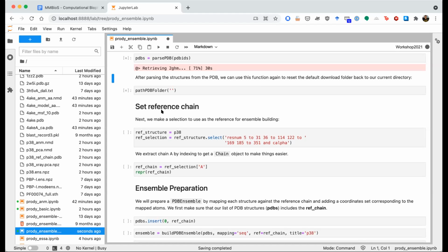And there was a question about whether the pickle file should be in the same location as the Jupyter Notebook file. The answer is yes, since it tries to load this pickle file this time. Okay.